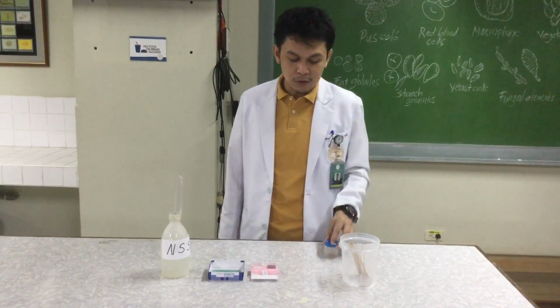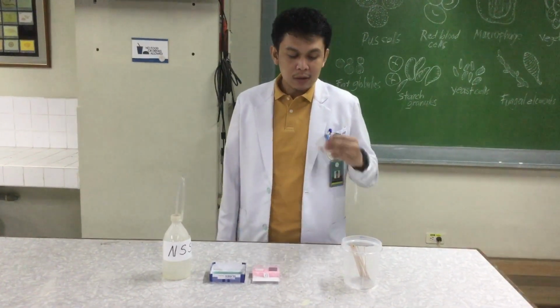Ideally, a stool specimen, especially if it's like this one, mucoid, watery, should be transported to the laboratory in less than 30 minutes. Because beyond 30 minutes, the trophozoites, which are commonly present, will die. So it's better to transport the specimen in less than 30 minutes so that it can be examined immediately. And of course, ideally, it should have a name.